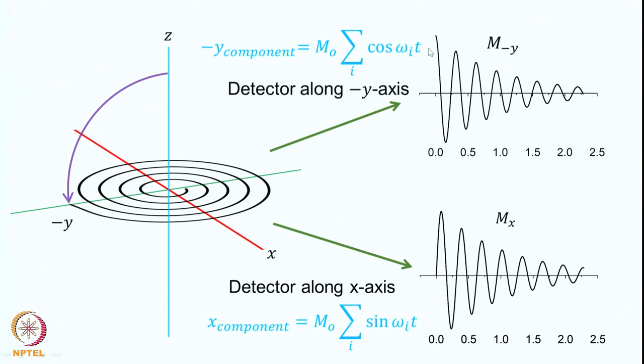So exponential decay will happen at this point, and therefore you will have the signal going like this. We may want to add that here to indicate the decay as well. So here, if you multiply this by e to the minus t by T2, and here also we multiply e to the minus t by T2, this is the transverse relaxation, and this allows for the decay of the signal.